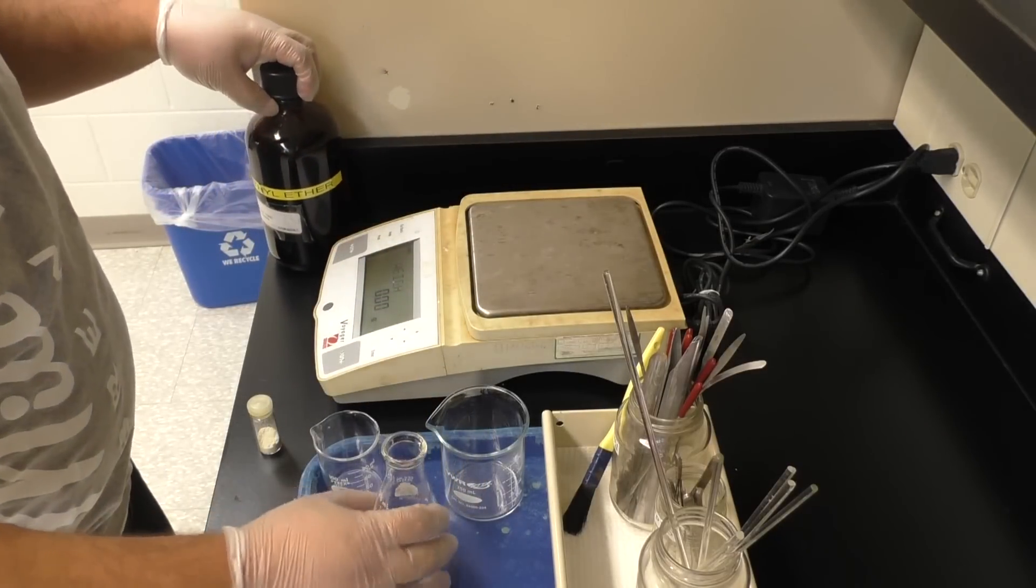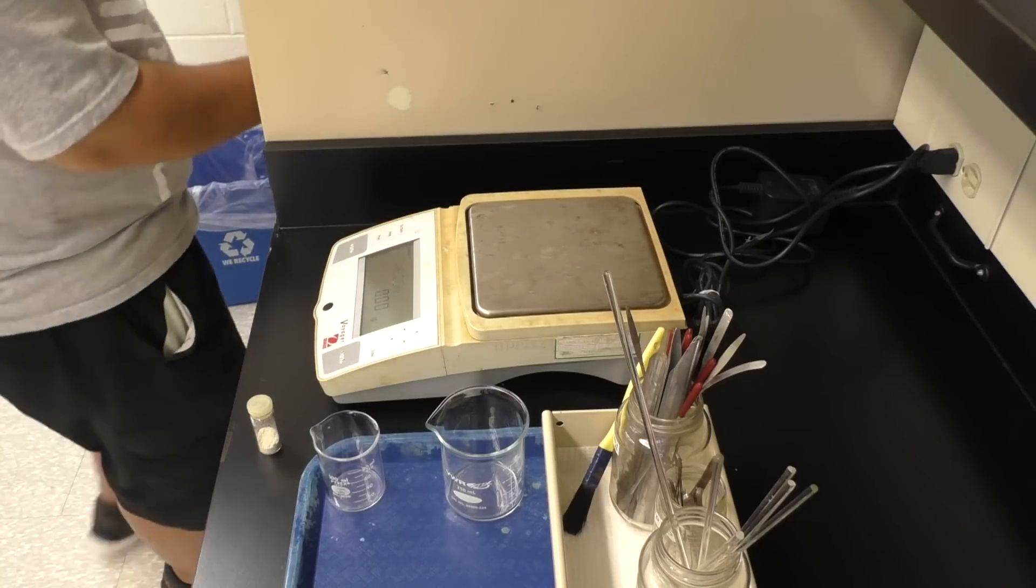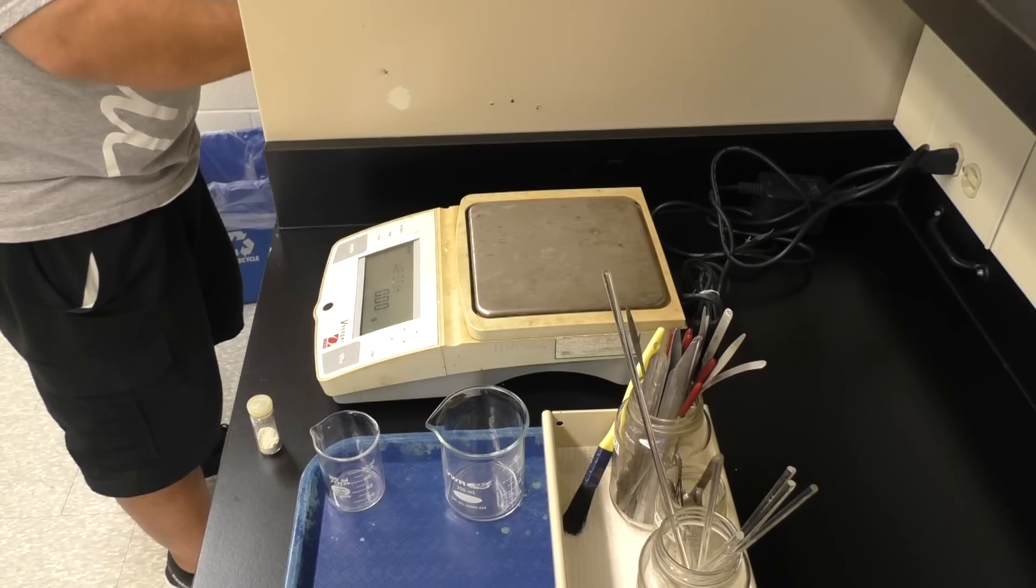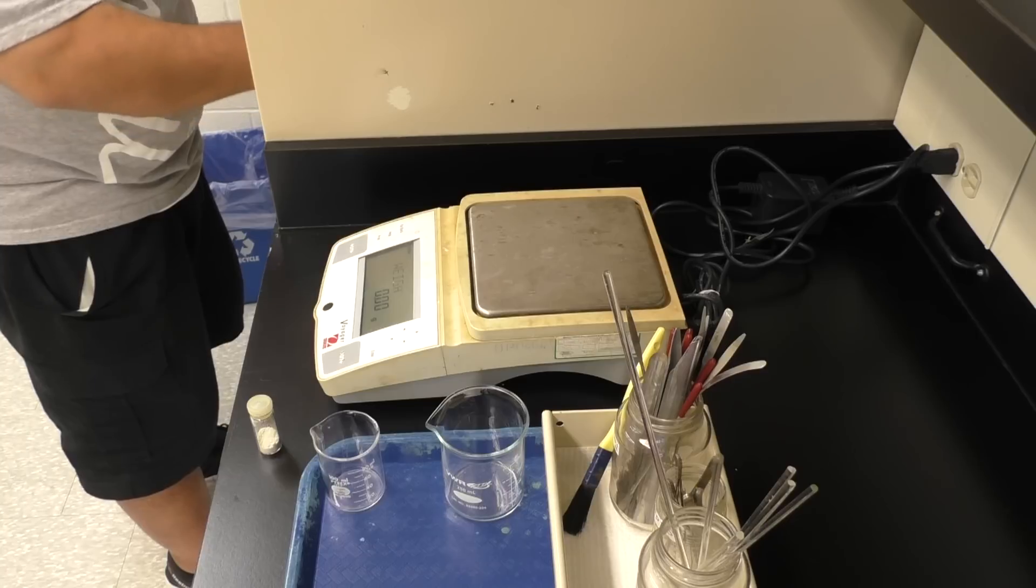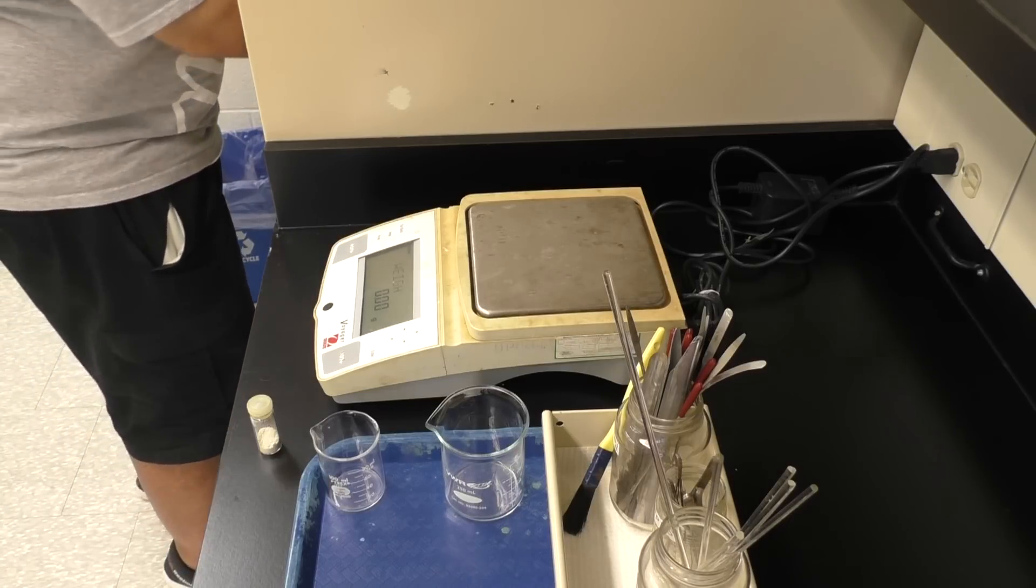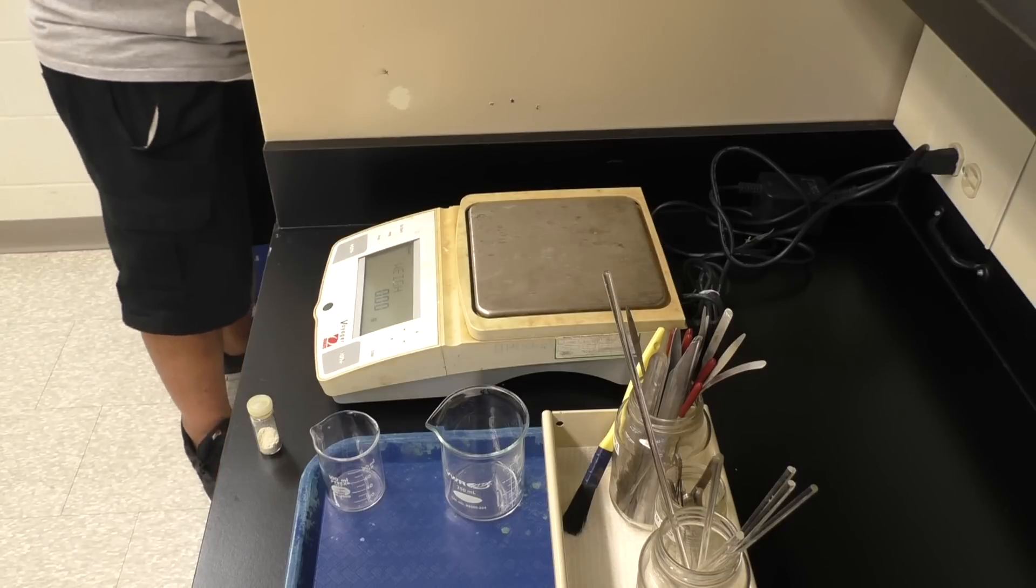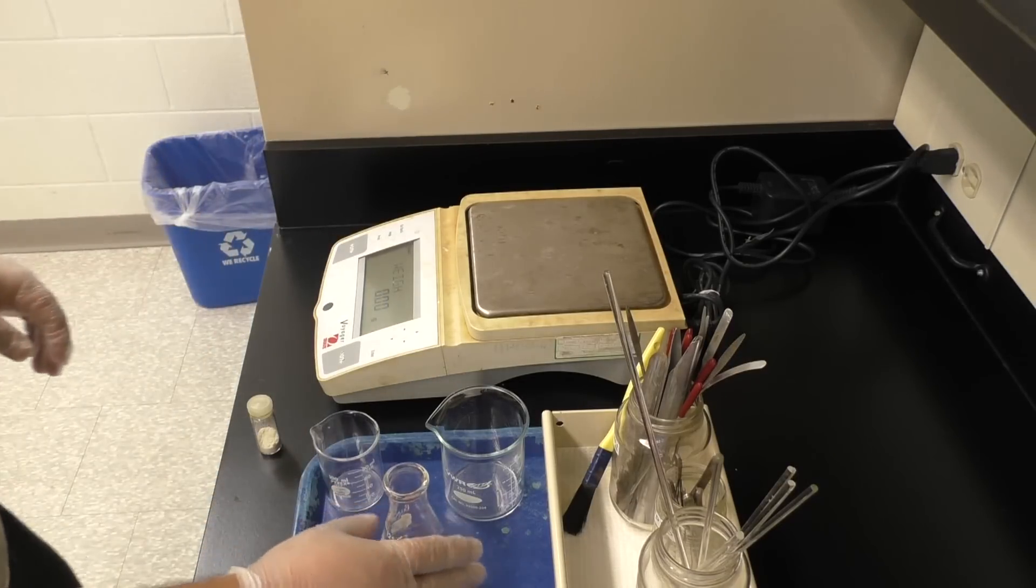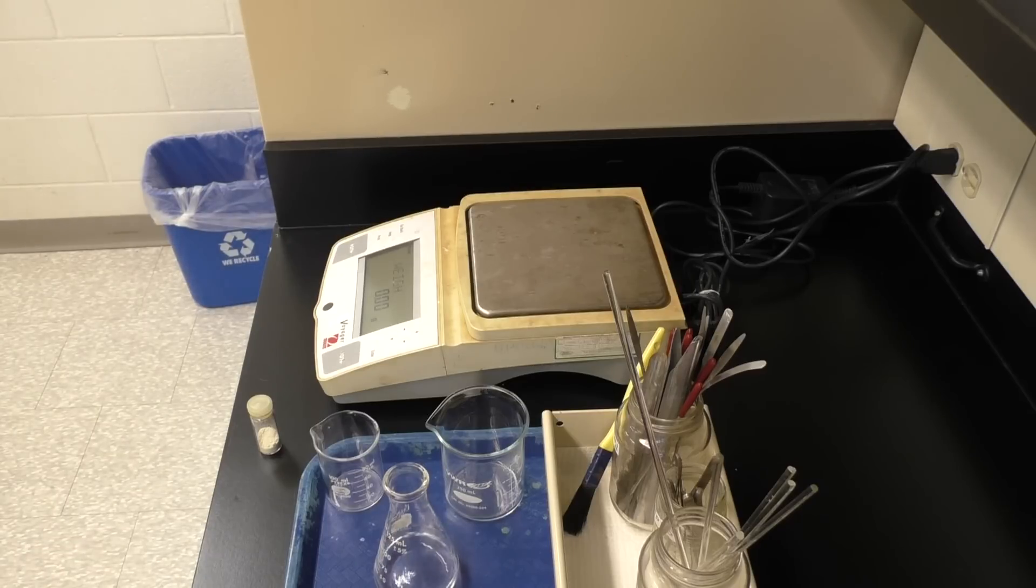In this you're going to need some diethyl ether to help dissolve your unknown, and essentially rinse it out of the vial. So before you go back to your station at the fume hood, make sure you get yourself some diethyl ether, and both you and the person next to you are going to need it. So you can actually save some time by getting enough for both of you.